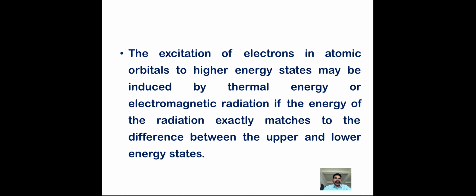This is due to the excitation of the electrons in atomic orbitals to higher energy states that may be induced by thermal energy or electromagnetic radiation, if the energy of the radiation exactly matches the difference between the upper and lower energy states. So what happened?